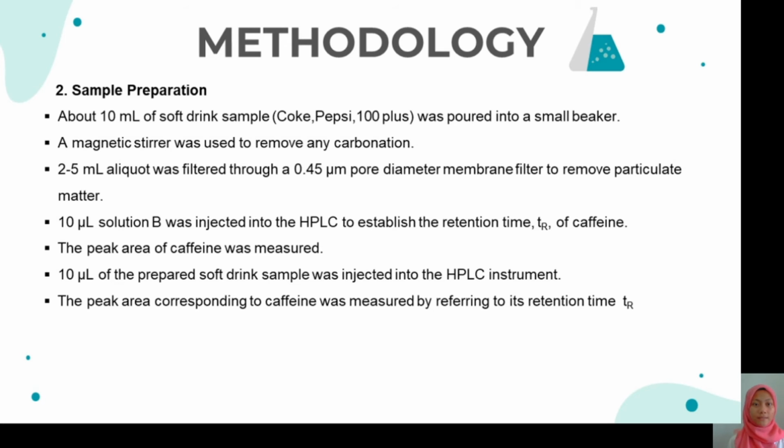10 microliters of solution B was injected into the HPLC to establish the retention time of caffeine. The peak area of caffeine was measured, and then 10 microliters of the prepared soft drink sample was injected into the HPLC instrument. And lastly, the peak area corresponding to caffeine was measured by referring to its retention time.